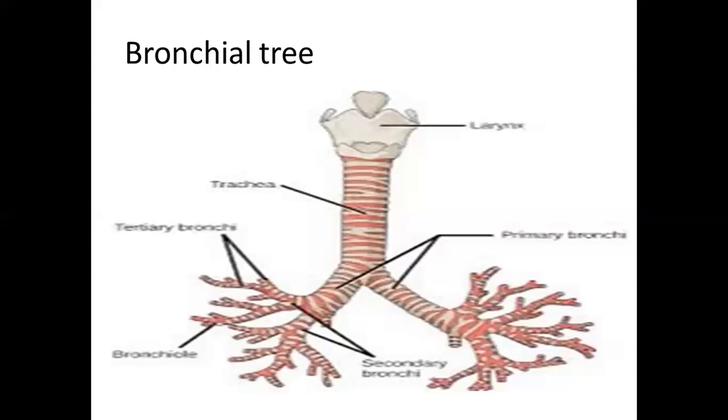بعدين ال airways that are located inside the lung. لما نجي ندخل inside the lung يعني لحد هذا الحد اللي هو يكون ال outside، هذا هو ال extra pulmonary أو ممكن نسميه primary bronchi. بعدها من تجي تدخل لللانج داخل اللانج، هنا ايش راح نجي نسميها؟ راح نجي نسميها intrapulmonary bronchi, lobar, secondary, and after that comes the segmental tertiary bronchi. تمام.